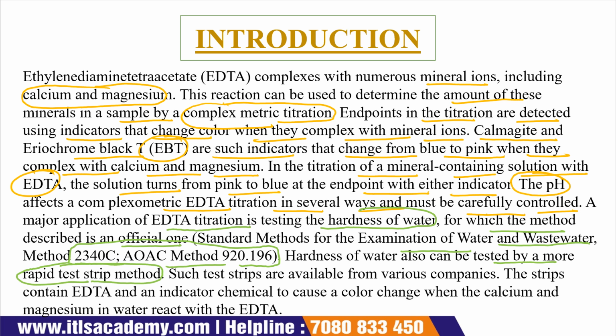Now, these strips are available from various companies, and the strip contains EDTA and an indicator chemical to cause a color change when the calcium and magnesium in water react with the EDTA. It is simply a strip in which the EDTA chemicals are present, and it also contains some indicator chemicals which change the color of the strip when it is dipped into water which contains calcium and magnesium ions.